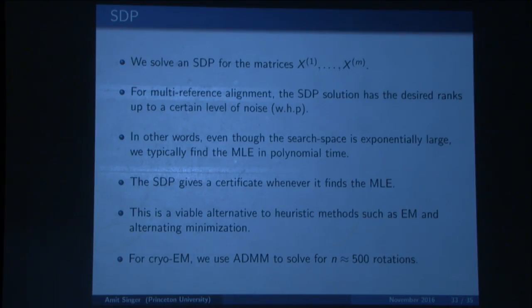For cryo-EM, this is still a work in progress, so we have an implementation that uses ADMM, and right now we're able to solve for about 500 rotations. We're trying to make it scale even more.